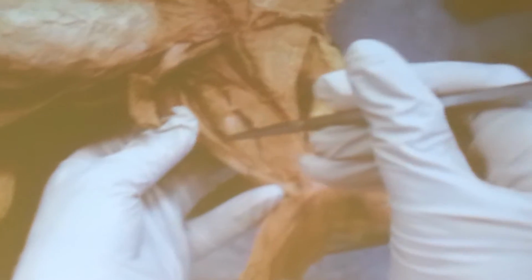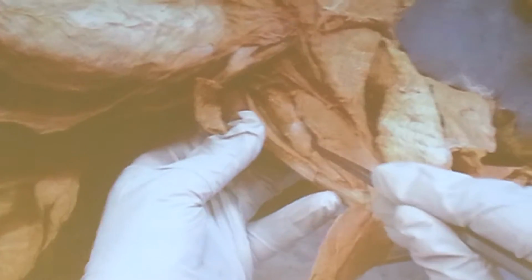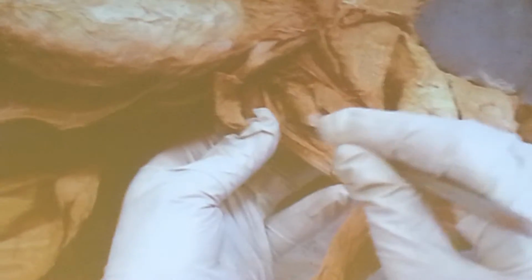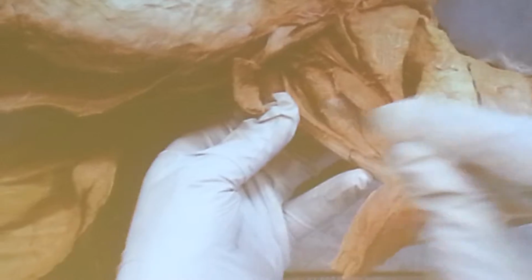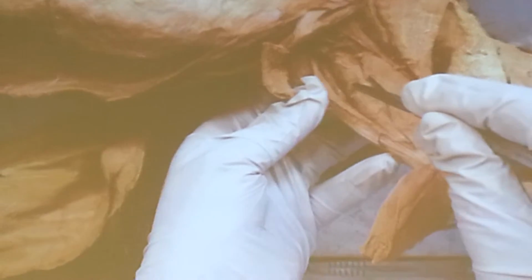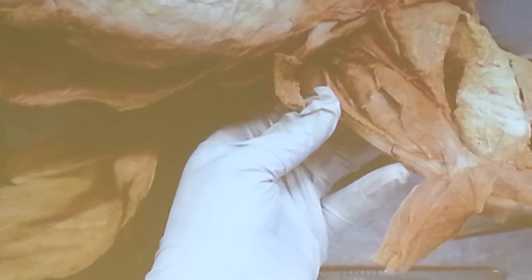Then when you put this away, you see the other muscles. In the cat, we have three muscles here. The first one in the middle is rectus femoris. Remember, we have rectus abdominis and rectus femoris, both on the anterior side. On the medial side of rectus femoris, we have vastus medialis. On the lateral side, we have vastus lateralis. All of them are lateral to the femoral artery and vein.